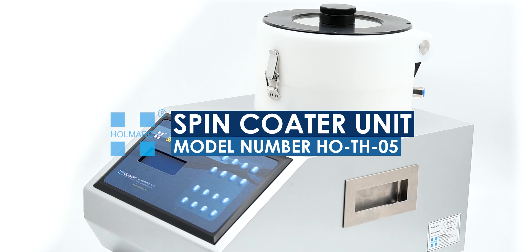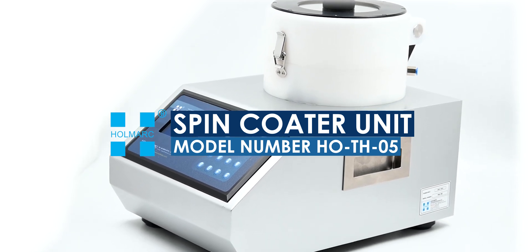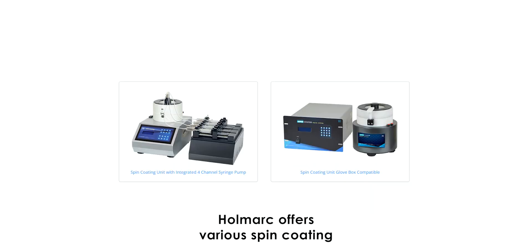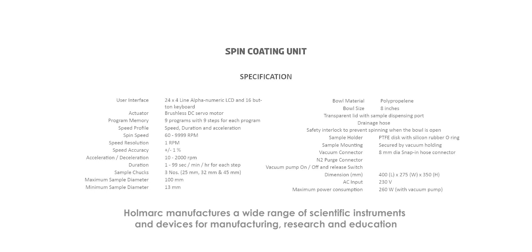Holmarc spin coater unit model number HO-TH-05. Holmarc offers various spin coating units tailored to specific application requirements. Holmarc manufactures a wide range of scientific instruments and devices for manufacturing, research, and education. Visit us at www.holmarc.com and contact us at sales@holmarc.com. Order your products now.